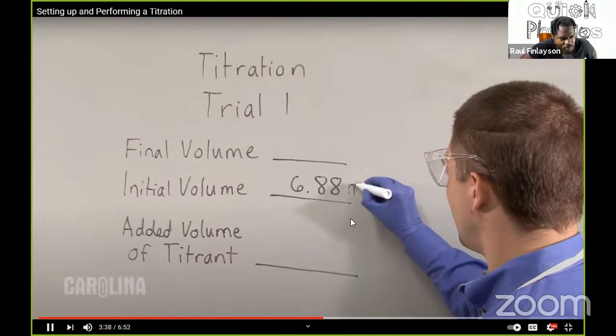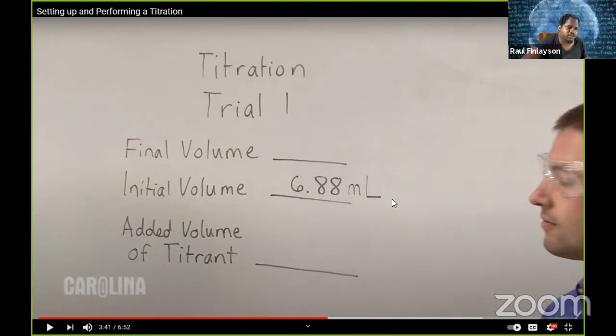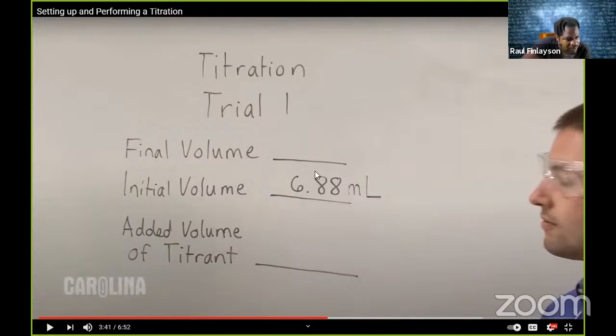Secondly, it is important to read your volume to the correct number of significant figures. You see, it uses milliliters, guys. Just highlight that milliliters is the same thing as cubic centimeters. Everybody get that?